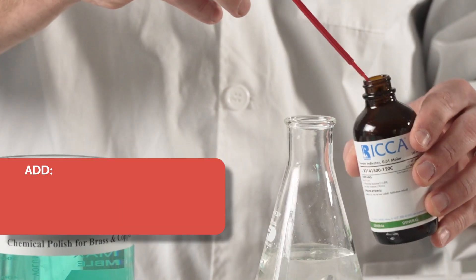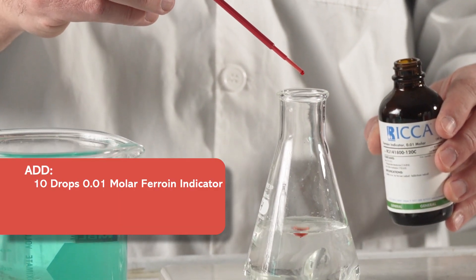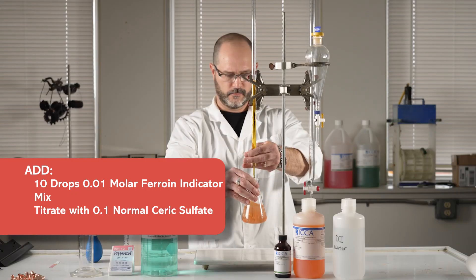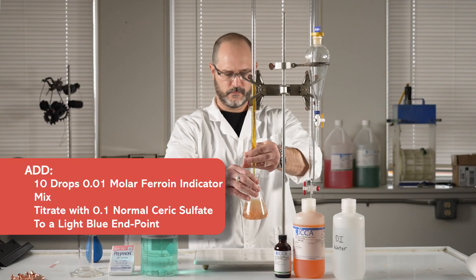Then, add 10 drops of 0.01 molar ferroin indicator and mix. Titrate the solution using 0.1 normal ceric sulfate until a light blue or light blue-green endpoint appears.